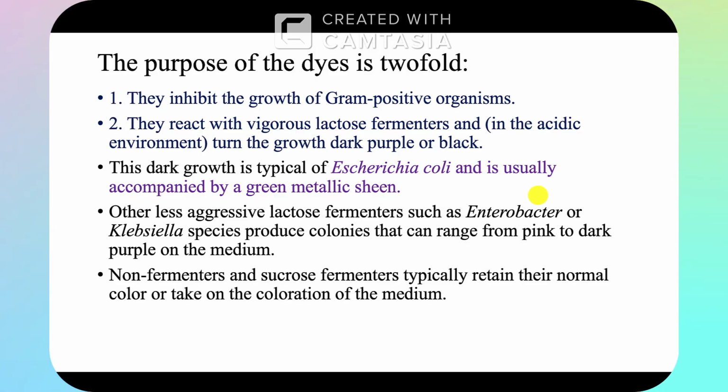The other bacteria of Enterobacteriaceae, or other less aggressive lactose fermenters such as Enterobacter and Klebsiella, produce colonies whose color is from pink to dark purple on this media.